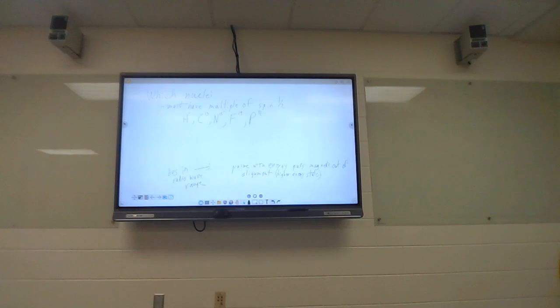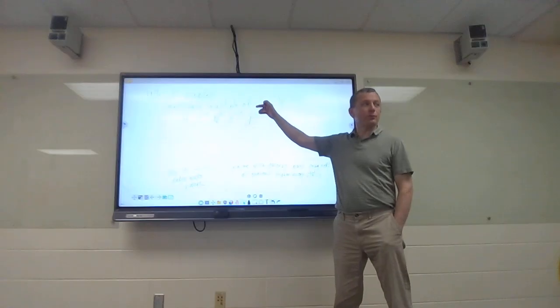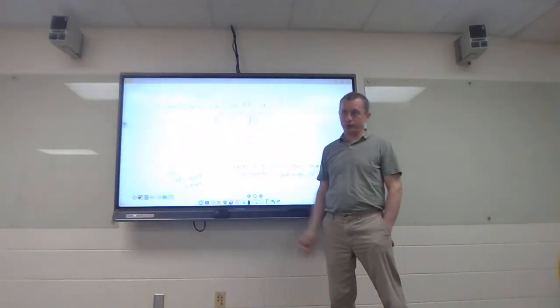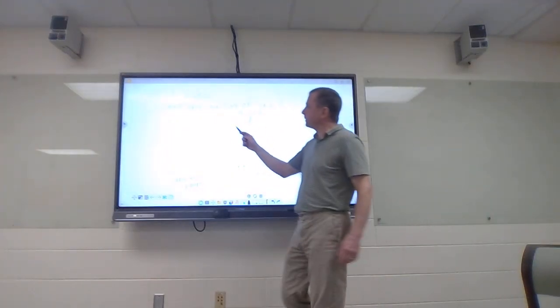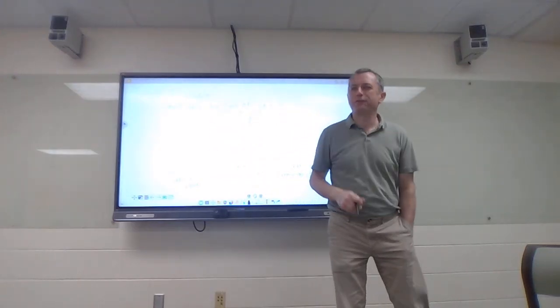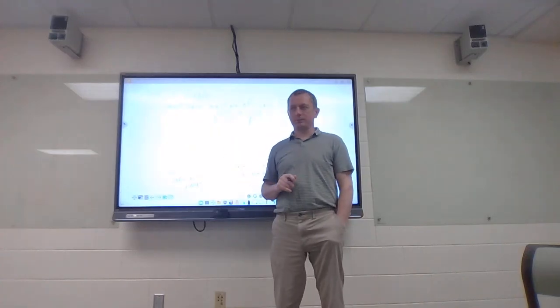yeah, you're right. I'm thinking chlorine there. Yeah, 31. You're right. P-31. Now, again, that's one of the more abundant isotopes of phosphorus. So phosphorus will show up in an NMR very abundantly as well. So these are some of the more common ones. This one tends to be tough, very tough, very tough. Most of the time it's hydrogen and carbon.